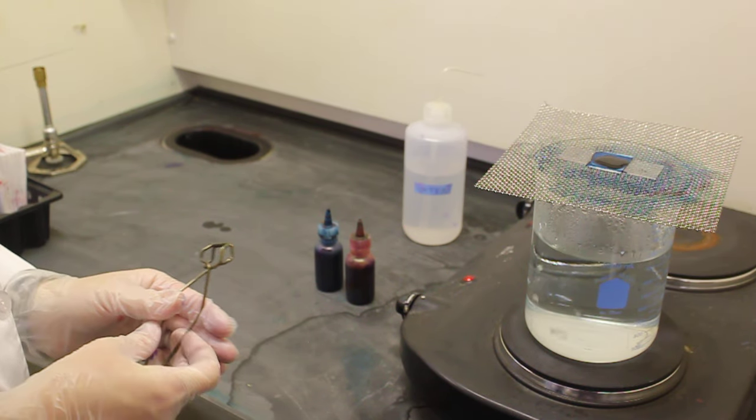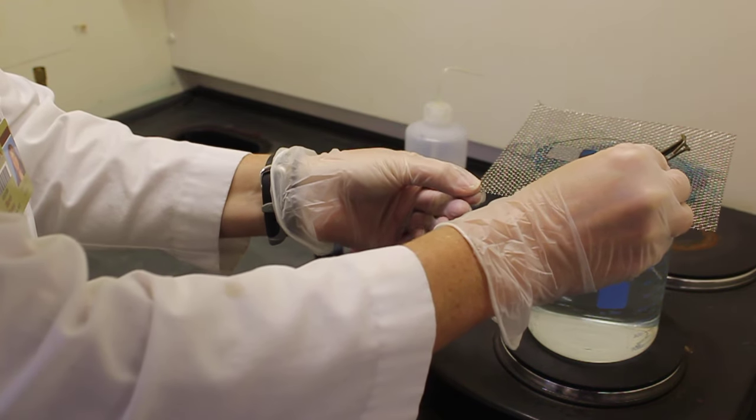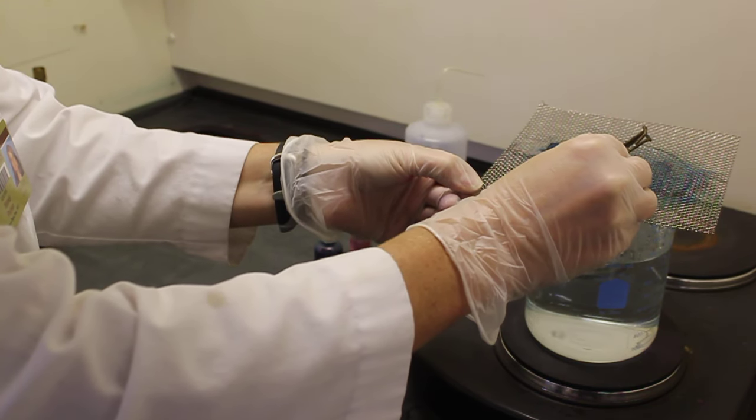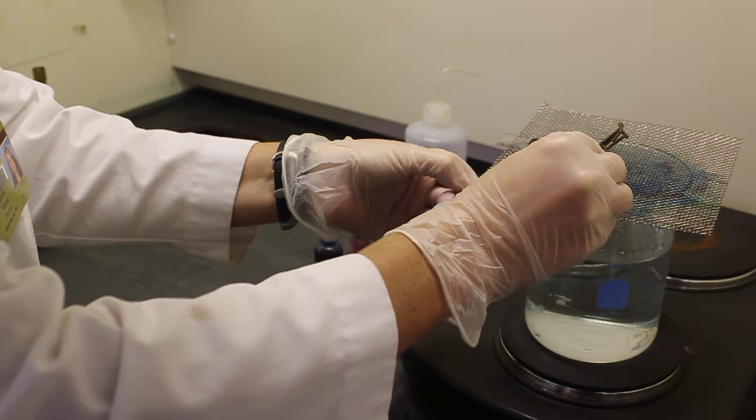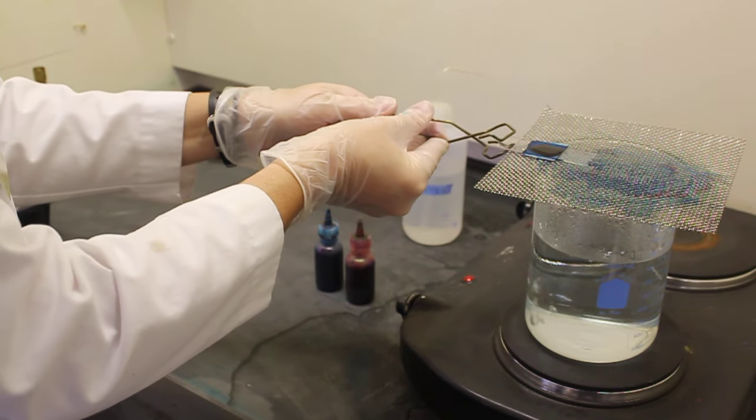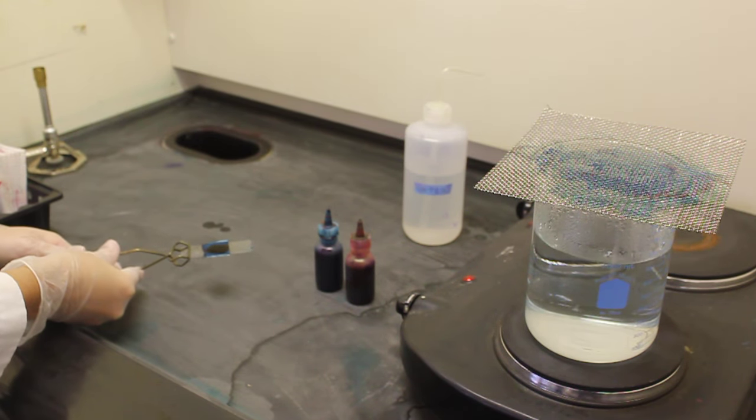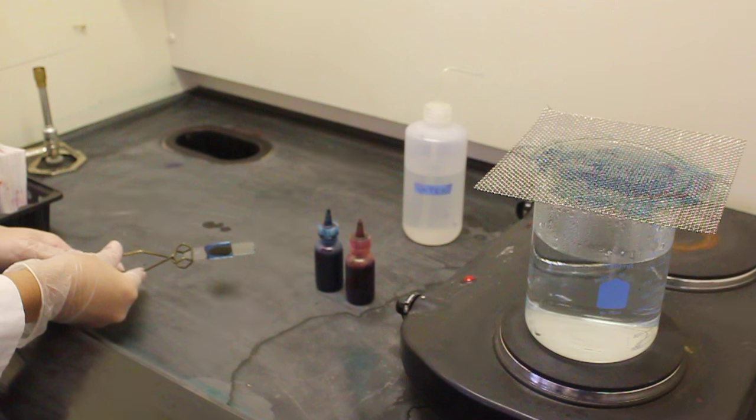Once the five minutes is up, while being very careful, you can take your slide off of the hot plate. I find the best procedure is to use the test tube tongs to slide the slide out of the steam and grab the slide. It is very important at this point to let your slide cool off before you grab the slide with your hand.